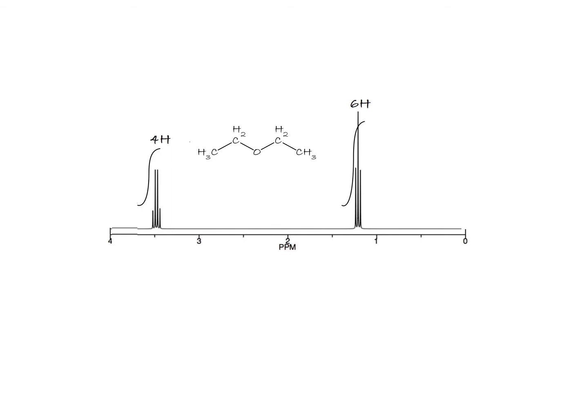What we observe is actually this type of spectrum with fine structure. We call this first order spin-spin coupling.